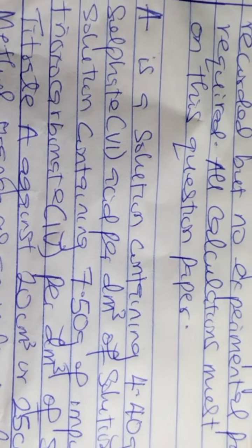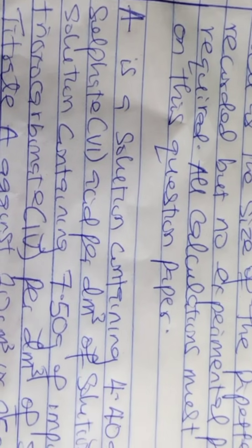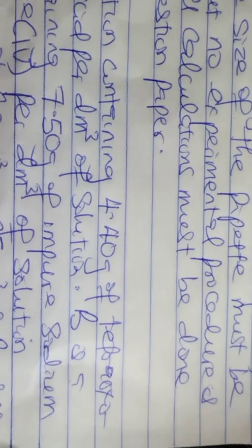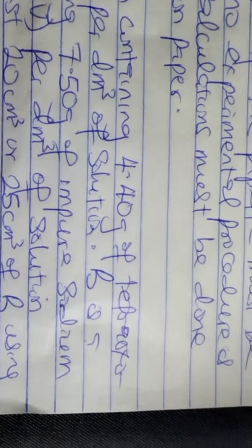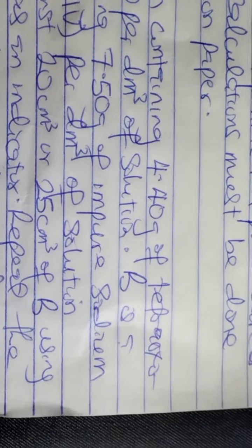Question says, A is a solution containing 4.40 grams of tetraoxosulfate(VI) acid per dm cube of solution. B is a solution containing 7.50 grams of impure sodium trioxocarbonate(IV) per dm cube of solution.